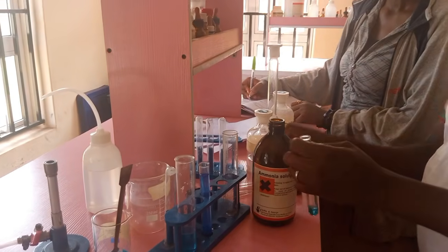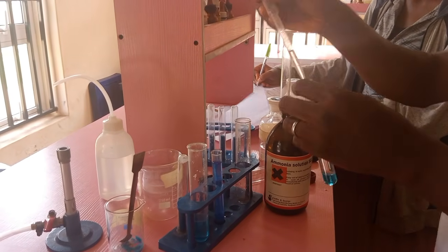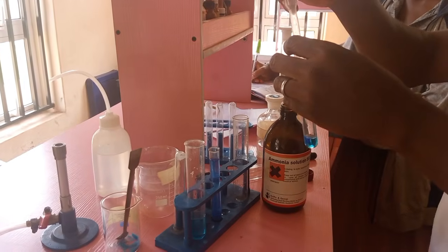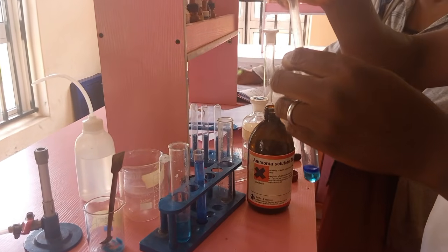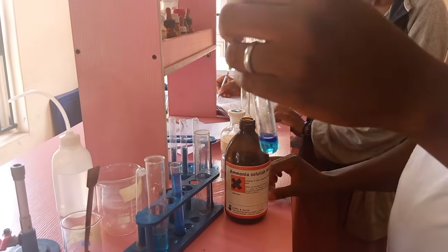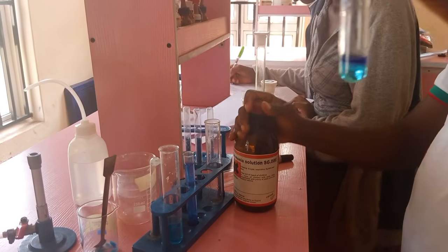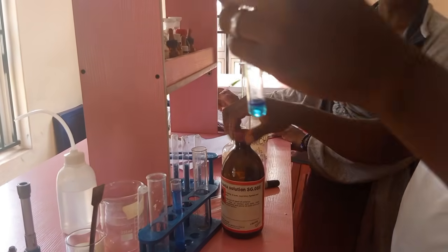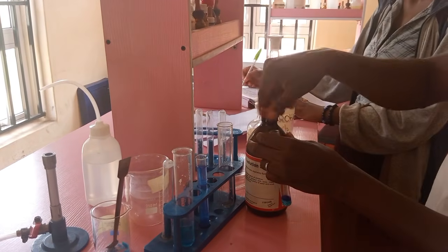Let me use this so it will be exact. In drops: 1, you see, 2, 3. Three drops is okay. Now can you see? Is that a deep blue coloration or light blue? Light blue coloration. Now let's add in excess.